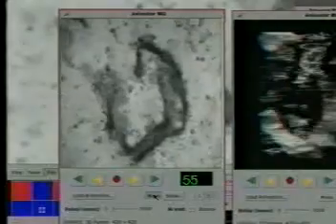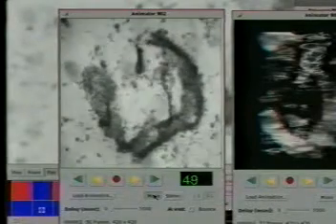So far we've shown you how we can remotely capture images off the microscope and perform wide area surveys of the sample. Another important feature of this application is the ability to do 3-dimensional reconstructions. We perform the 3D reconstructions of subcellular structures by using tomography. The specimen is on the microscope stage and can be tilted at plus or minus 60 degrees.